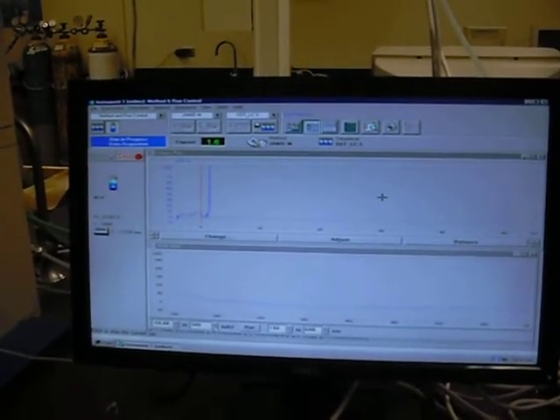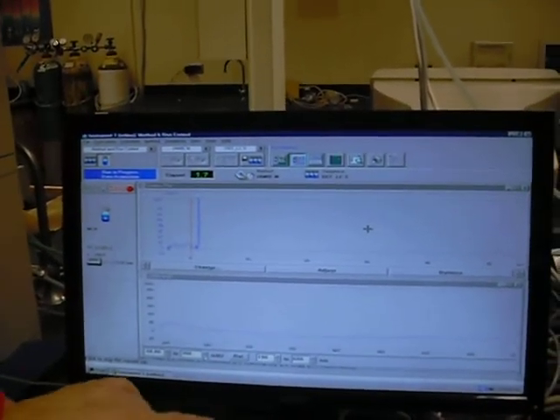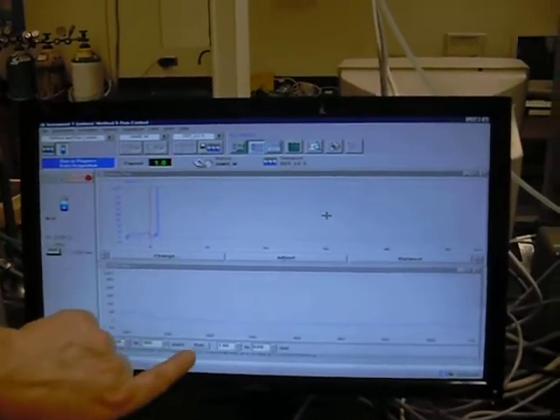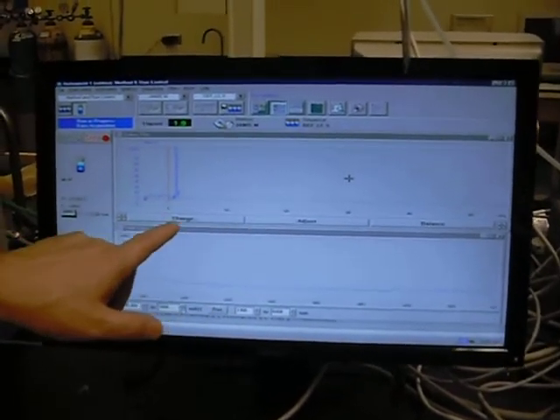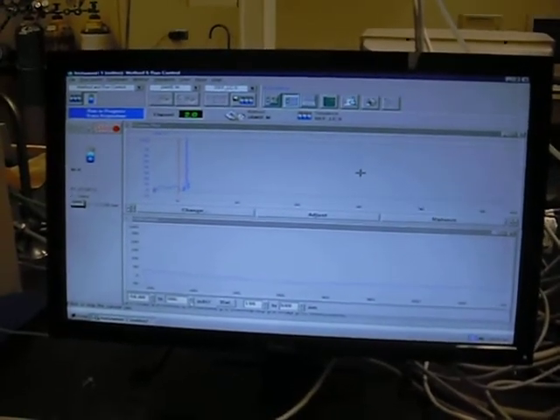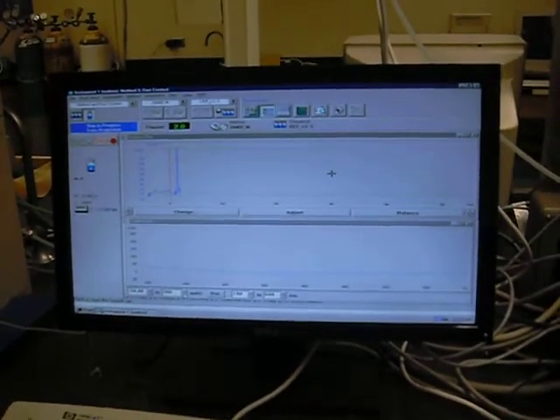And then you can also see contextually why we ran the UV vis in advance, because it shows you what wavelengths you're most sensitive to. So the absorbance at just one of these wavelengths is recorded versus time. And so the selection of the wavelength determines the relative sensitivity that you have towards different analytes.